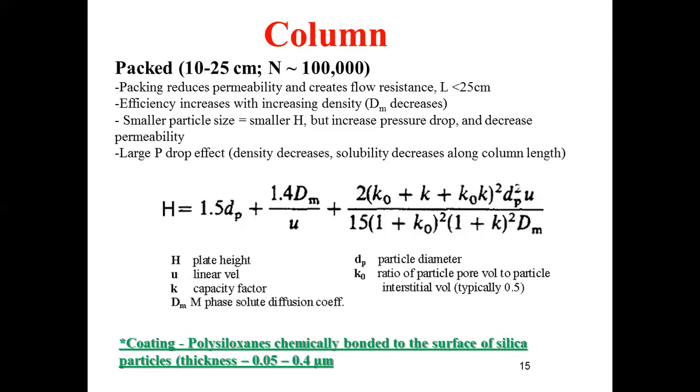And you have to concentrate on the multiple path transfer term in the Van Deemter equation, how to reduce the value of H whenever the solute is moving in multiple paths. That is only by decreasing the particle size. If the particle diameter is very low, it can be consistently packed into the chromatographic column. As a result of the lower particle size, the value of H will also become low. So as the value of H becomes low, the N value will become high, and therefore the efficiency of the separation will become high. Column efficiency will become very high.